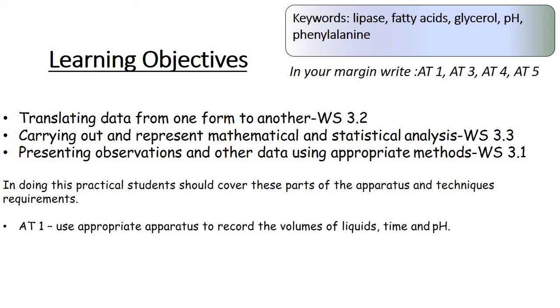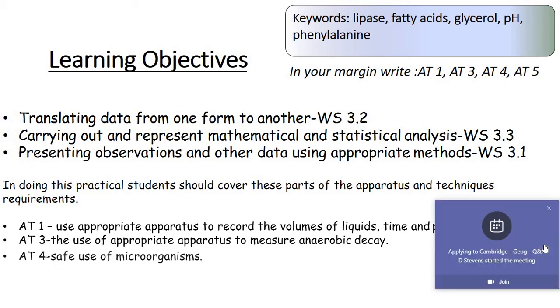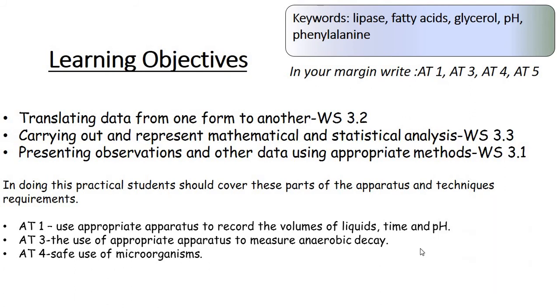This is part of our required practical. Use appropriate apparatus to record the volumes of liquids, time, and pH. So, of course, these are the skills that we'll be able to demonstrate if we were doing the practical in the classroom. And don't panic, we will do this practical. The use of appropriate apparatus to measure anaerobic decay. Safe use of microorganisms as well.